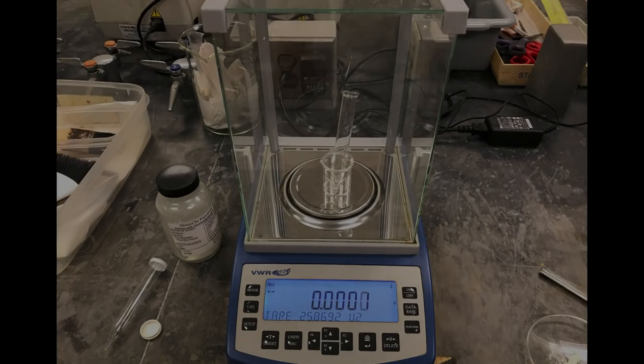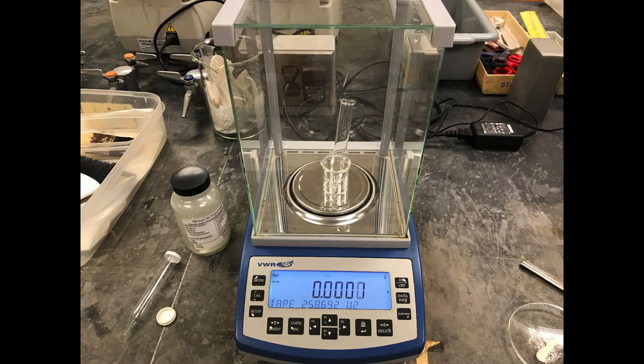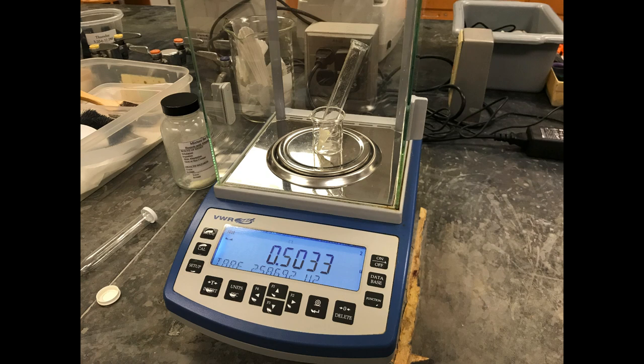We start by taring or zeroing a centrifuge tube that is held up within a beaker. We weigh out approximately 0.5 grams of the mixture containing all three compounds. Always record the exact mass of measured materials out to the fourth decimal place.